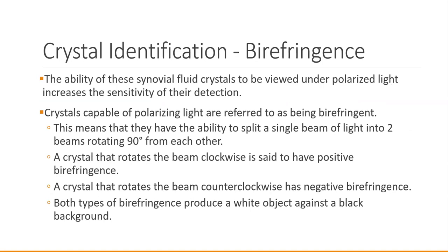Your textbook talks about viewing a sample with polarized light, but it really doesn't go into what is polarized light. So, birefringence is something that needs to be discussed. The ability of these synovial fluid crystals to be viewed under polarized light increases the sensitivity of their detection, and polarization is an important way to do this.